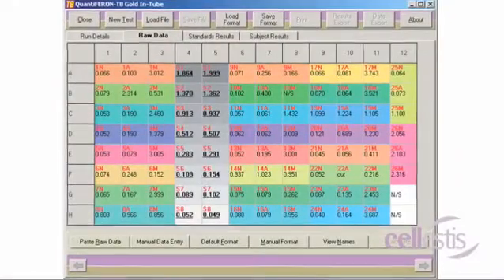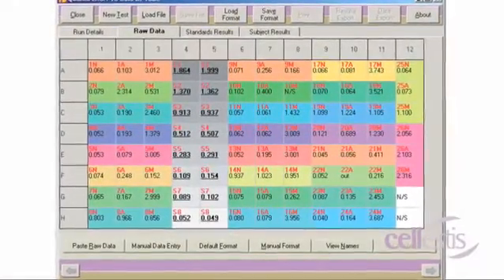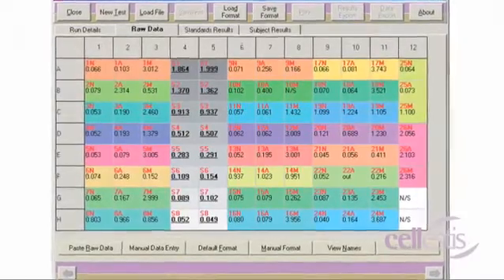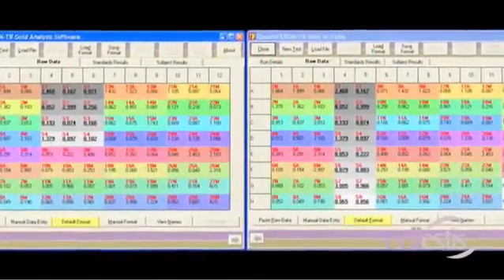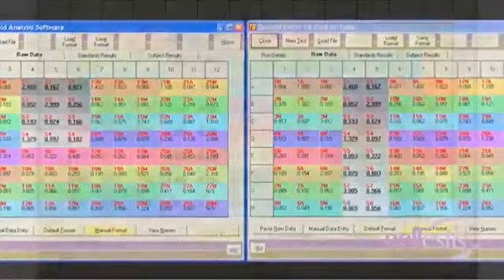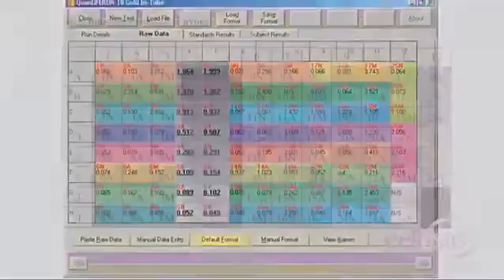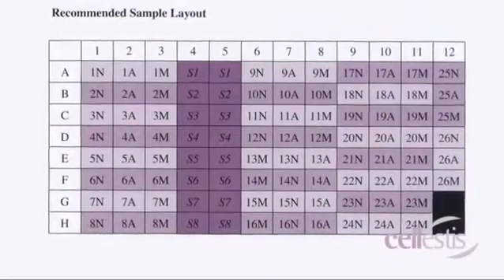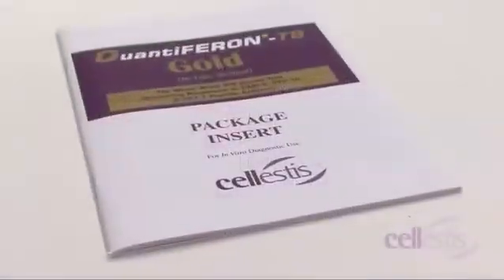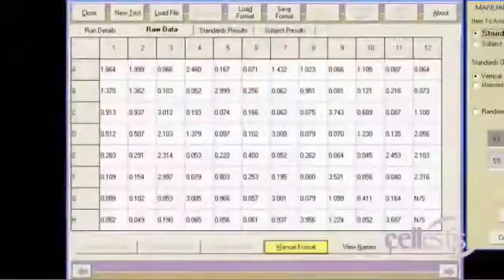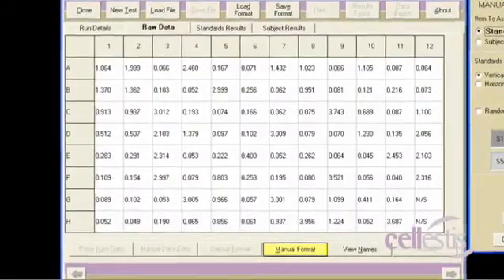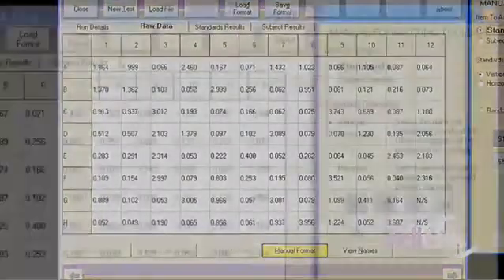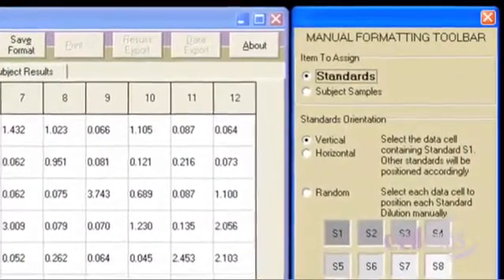Before data can be analyzed, formatting needs to be applied to nominate which cells are samples and which are standards. Formatting can be done either by default or manual method. The default format is used when the samples and standards are configured as per the recommended Cellestis layout. Please refer to your package insert. The Manual Format button opens the Manual Formatting Toolbar, which allows you to manually assign both standards and subject samples.